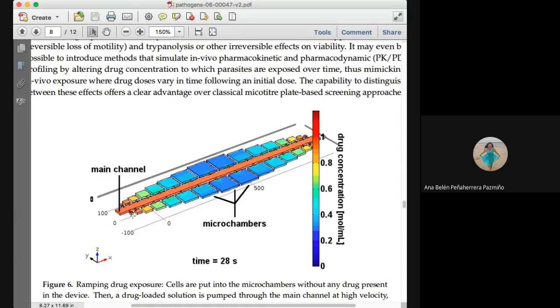They have small squares and then increase the size and also increase the concentration, and in the middle they put the drugs. These are the techniques that they use also to separate and also to test drugs.